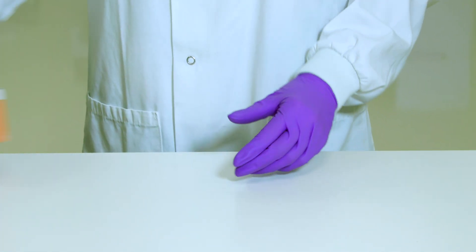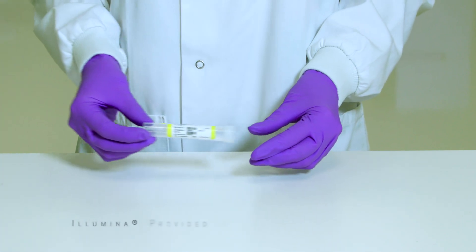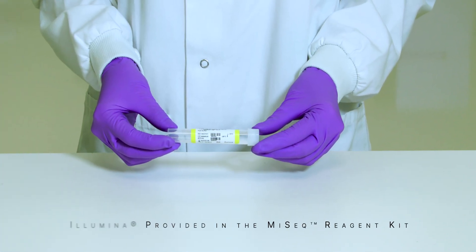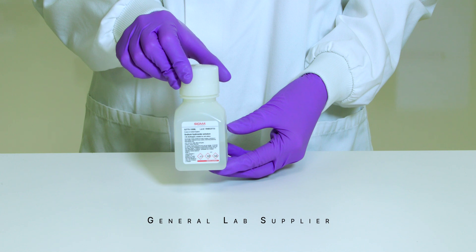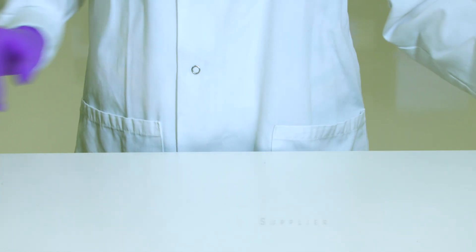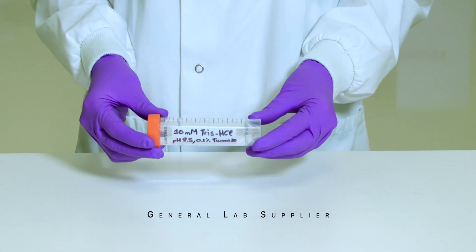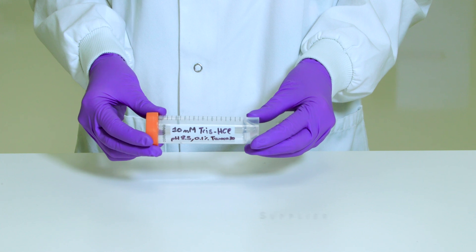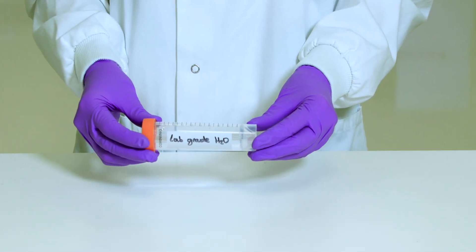In order to follow this procedure you will need the Illumina PhiX Control V3, the HT1 buffer, stock 1.0 normal NaOH, 10 mM Tris-Cl at pH 8.5 with 0.1% Tween 20, and laboratory grade water.